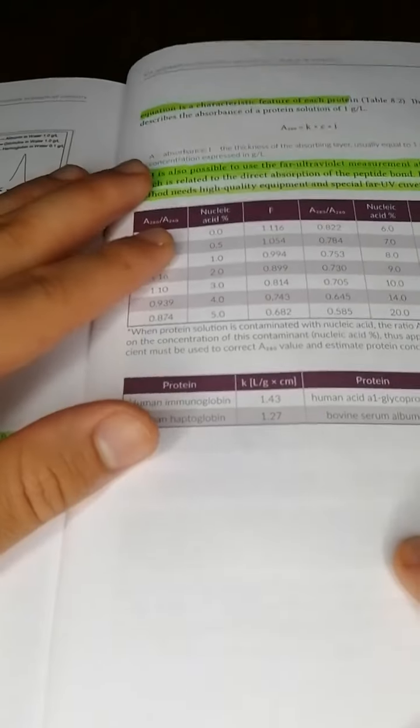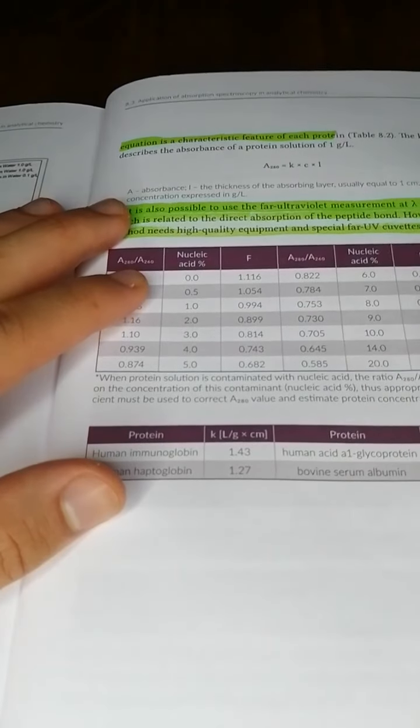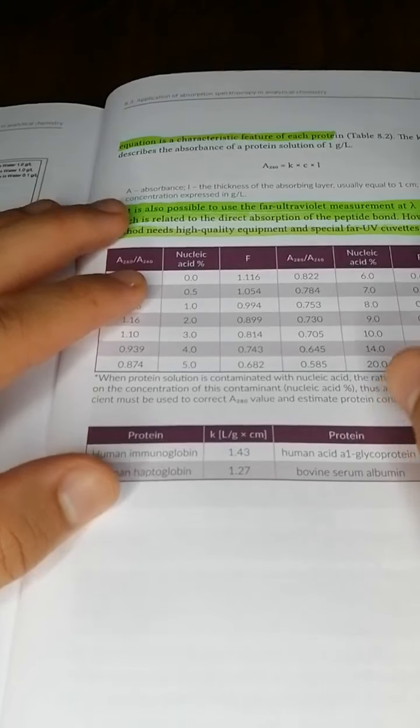For a certain protein, you can identify which protein it is by the absorptivity of that protein.